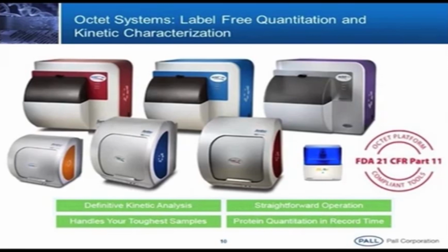These are the very high throughput instruments. This one is a 384 well plate format, 16 channel instrument. The sensitivity is similar to the red one, and we can perform quantitation and kinetics at a high throughput level. The blue one, once again, has similar sensitivity but only for proteins, not for small molecules and peptides. This is a high throughput machine. This is also very recently launched. It has 96 channels.